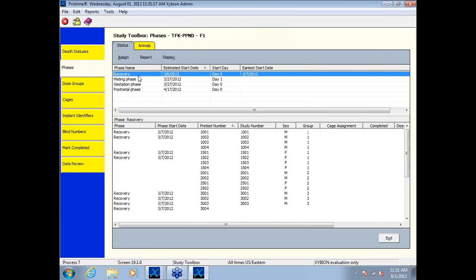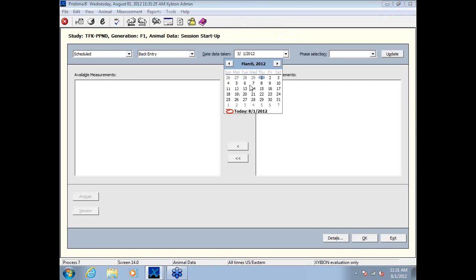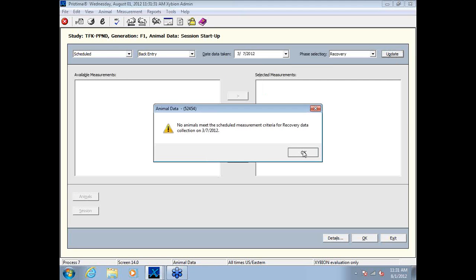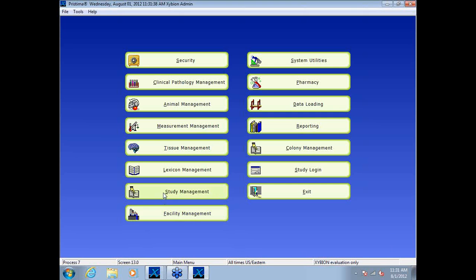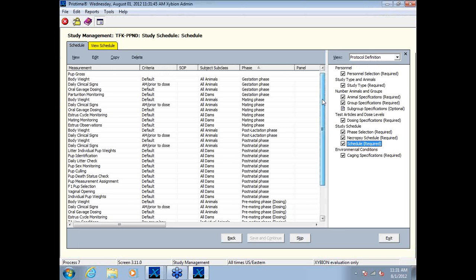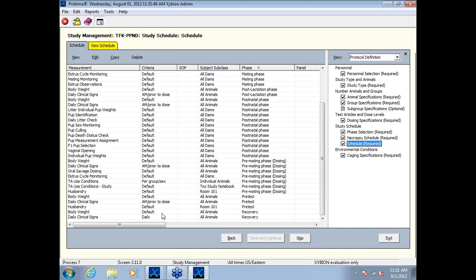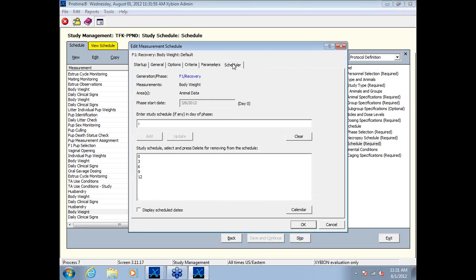Let's see, when do I have this? 3/7. Maybe I didn't schedule animals. Just to add it, to do it.